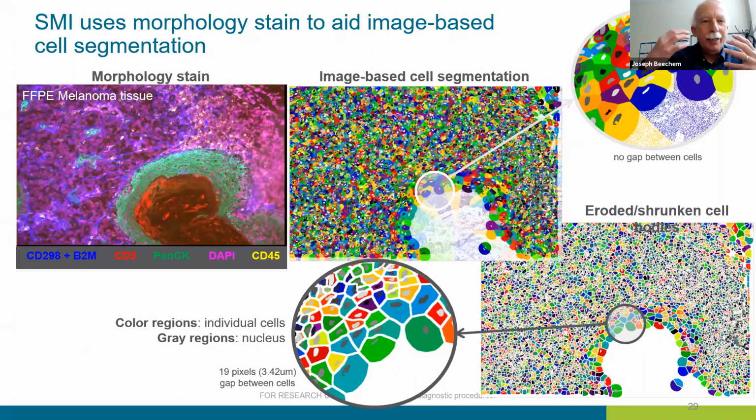And now this is really sort of a full-blown version of that. I view segmentation as still a slightly unsolved problem in this area. We spend a reasonable chunk of time on it, and I'm pretty happy to have gotten it to this place. So I'll just walk you through this. You can see the melanoma tissue over on the left-hand side. We're probing it with this 1000-plex. Inside that 1000-plex, I really want to know where all those RNAs are in which particular cell. We also got a DAPI nuclear stain on there.